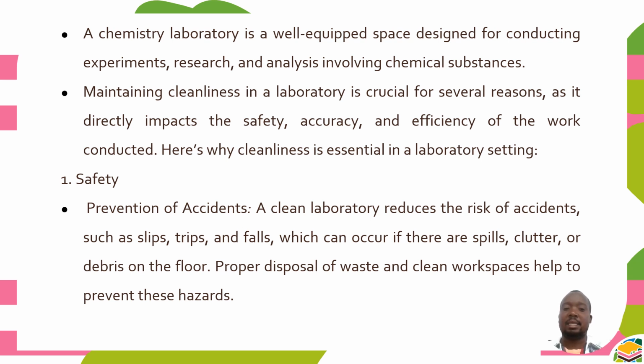Maintaining cleanliness in a laboratory is crucial for several reasons, as it directly impacts the safety, accuracy, and efficiency of the work conducted. And here is why cleanliness is essential in a laboratory setting. Well, it ensures safety, that is prevention of accidents.